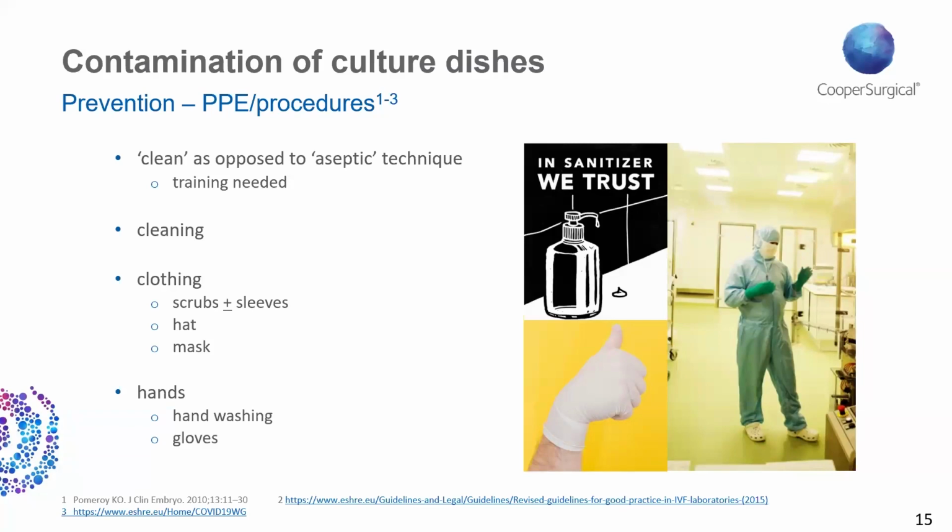One of the things of note is when you put your scrubs on in the morning, these don't protect you throughout the day if you go in and out of the lab. So be cognizant of that. They're not a protective barrier. They're only there to help you. And again, use of scrubs, use of gloves, etc., only work effectively if you use them in the right way.